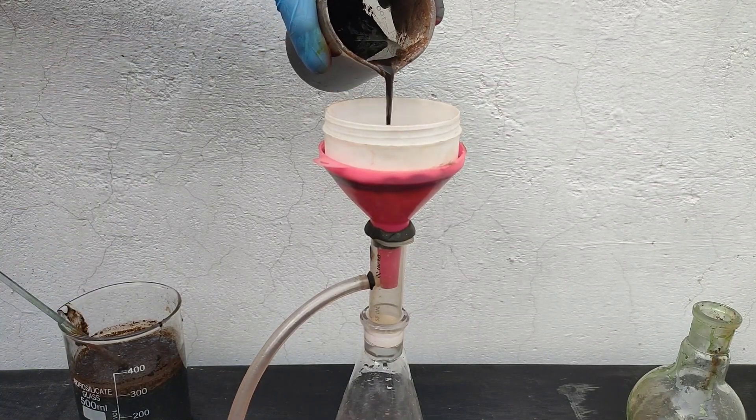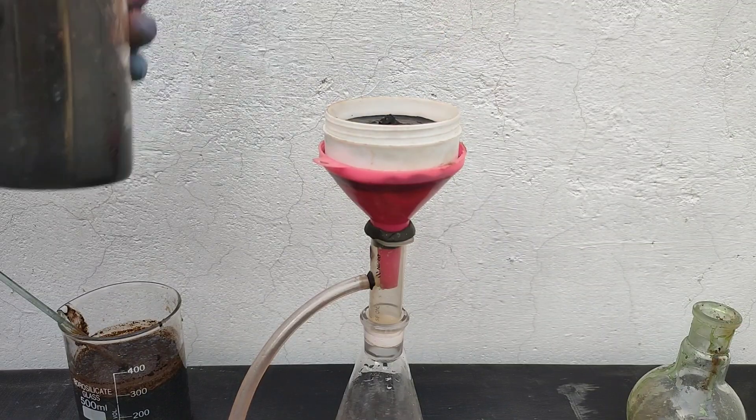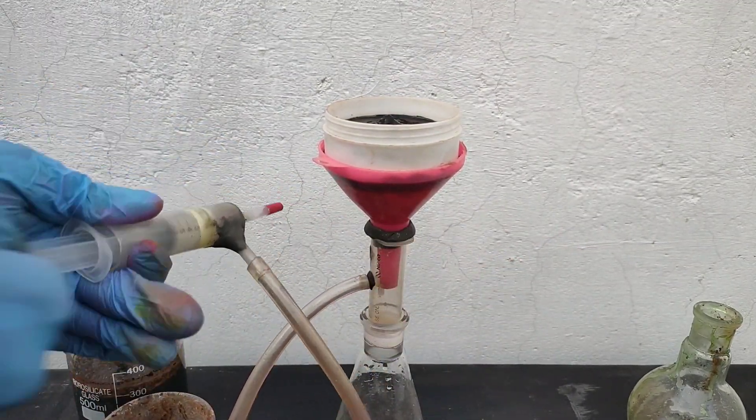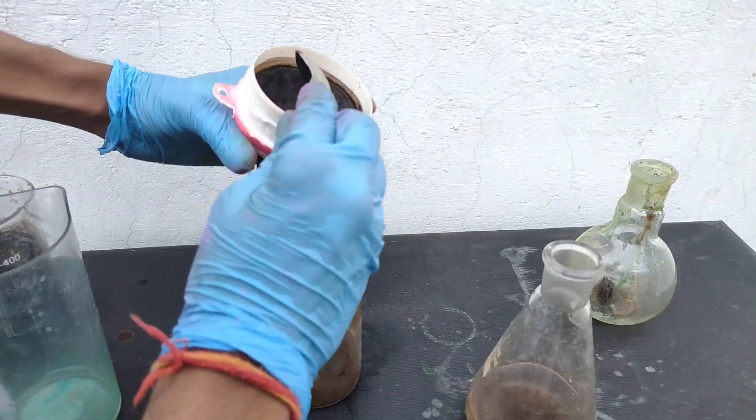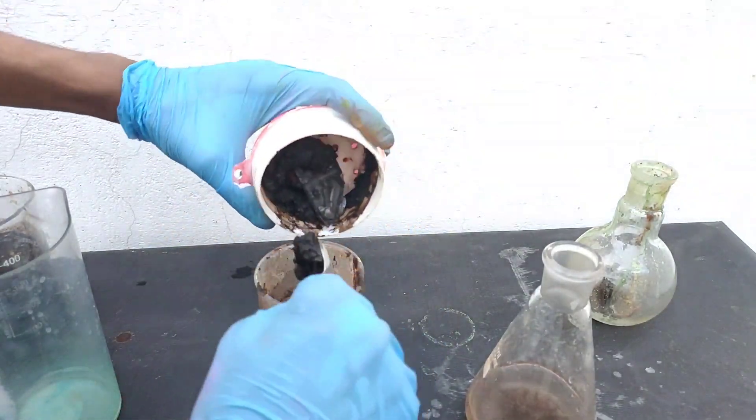Then I took the precipitate obtained via electrolysis and filtered it by my DIY Buchner funnel by vacuum filtration. Even on vacuum filter the filtration was very slow and took hours to filter. Had it been gravity filtration it would take days.